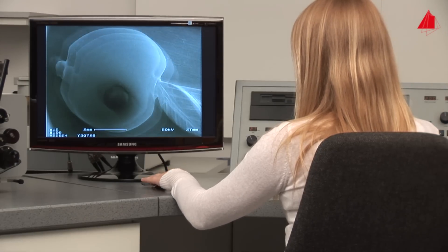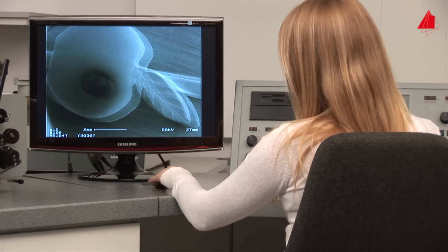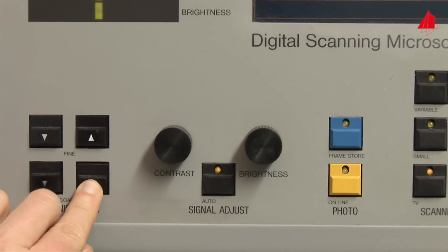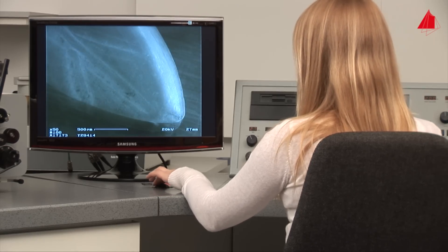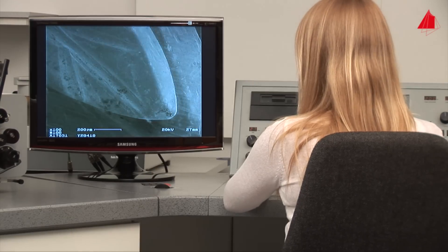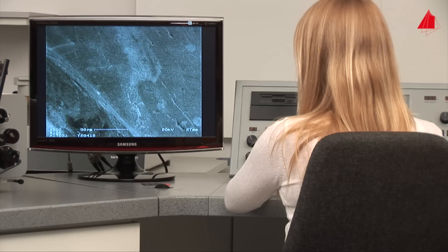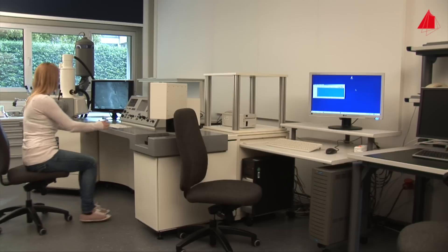Last in line is the golden piece of jewelry with a gemstone. The material tester is especially interested in the chemical composition of the gold material — does the promised gold content really exist, and which other elements have been added? She chooses a place near the edge of the piece, selects a suitable magnification, and makes use of a fantastic method: non-destructive chemical analysis with the scanning electron microscope.